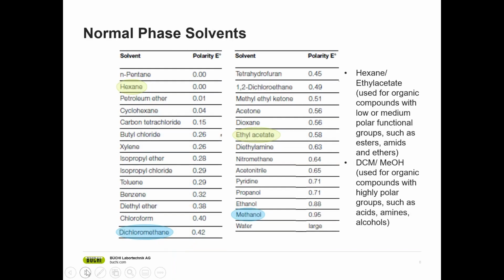In adsorption chromatography, the strength of the mobile phase or the solvent is determined by the elution time. The solvent strength is a property of displacing a substance from the active site of the stationary phase. In the case of alkane, for example, the property is very weak, while in the case of methanol, it is very high. In this sense, solvents are described as weak or strong. If the solvents are arranged in order of increasing strength, a so-called eluotropic series is obtained. Apart from the strength, however, there are also other factors that affect it.